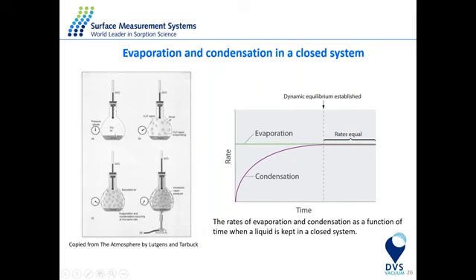This is the static method, so there is no moving part. A closed system means that air cannot come in and water cannot go out. Inside the flask, the water cannot come out and air cannot come in, so the closed system is completely isolated. That's why we have this stop plug on top with the thermometer, connected to a closed gauge. Initially, when you pour the water and close the valve, we measure the pressure of the dry air in the flask, and the pressure is almost zero.